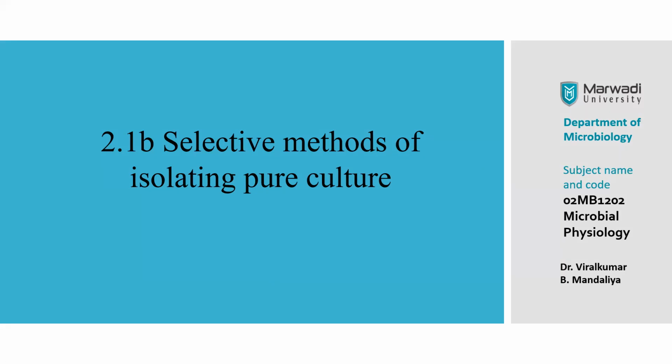Just good morning to all. So last time we were talking about selective methods, right? In that, previously we have seen the liquid and solid media and their characteristics. When we have the liquid process or the solid medium, either in a slant or in plates, we observe their basic phenomena. What their characteristics are, that was our basic target.